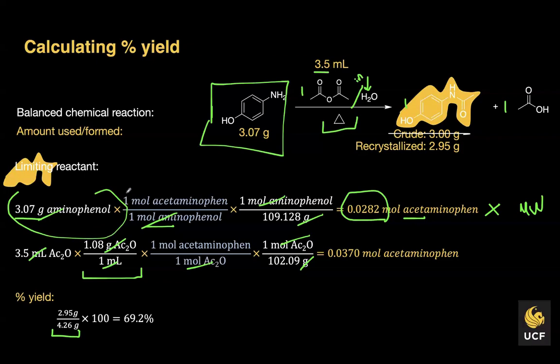Yes, you could put the mole to mole ratio anywhere, right? You could have put it at the end. You know, where you place them does not matter. You're welcome. All right, so make sure you include that on your poster. Okay? You could have abbreviated this as P, as long as you mention what the abbreviation is. Yes, it's actual over theoretical, much like if you're calculating your grade, what you earned over what was expected, right?